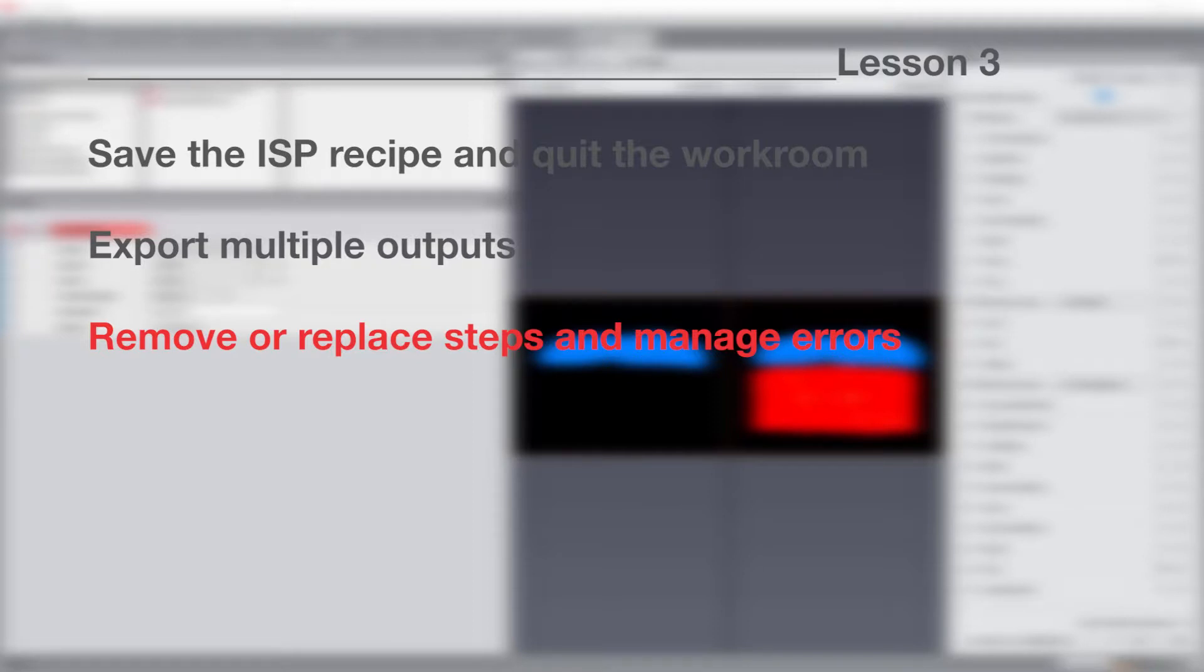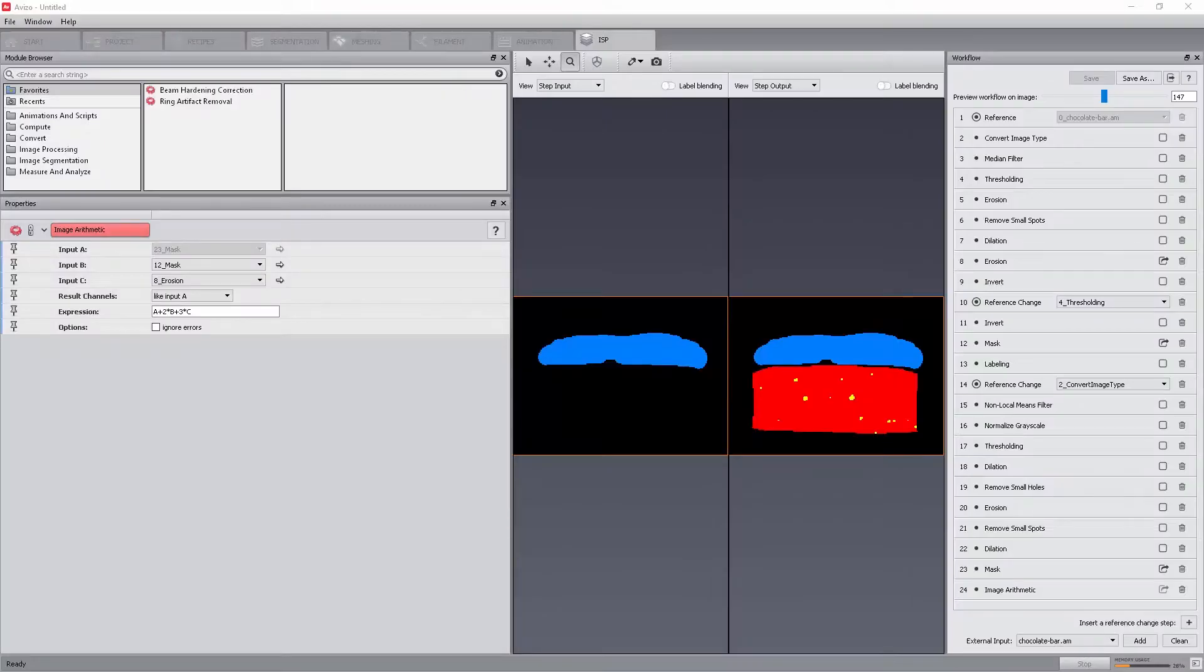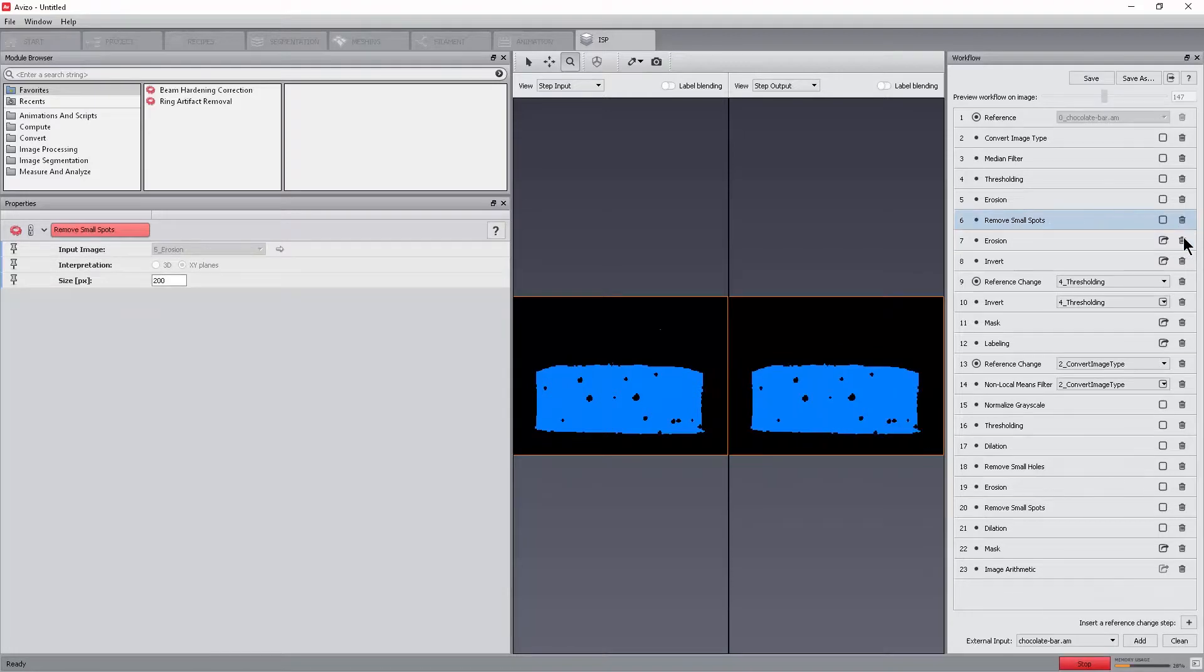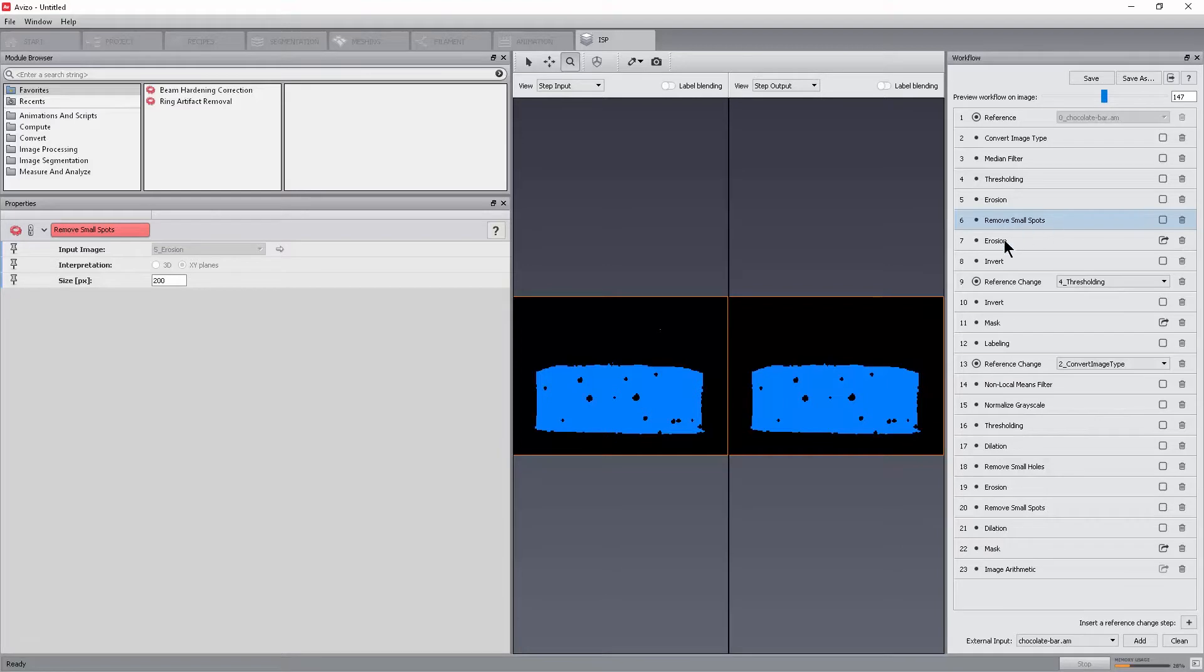In image stack processing, any step can be removed. As an example, we can replace the dilation followed by an erosion with a selective closing. Select step 7 and click the delete icon. The workflow is automatically recalculated to take the changes into account.